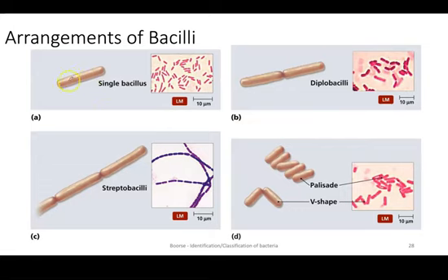Rod-shaped is a bacillus. So here's the micrograph, a picture through the microscope, and you can see these are elongated like little dashes. That's a single bacillus. They don't look like they're attached to one another. Here is an example of diplobacilli, and that's again an example where we have pairs, and these are end-to-end on the rod. So diplobacillus is two bacilli end-to-end.